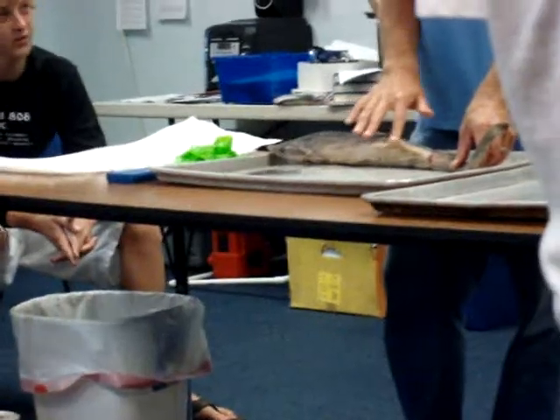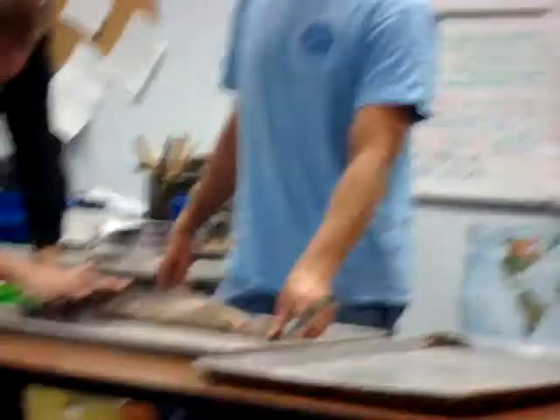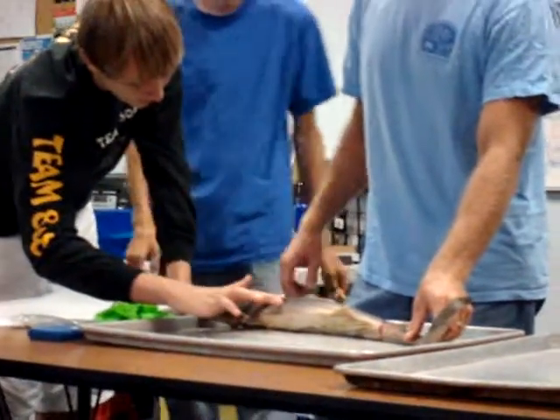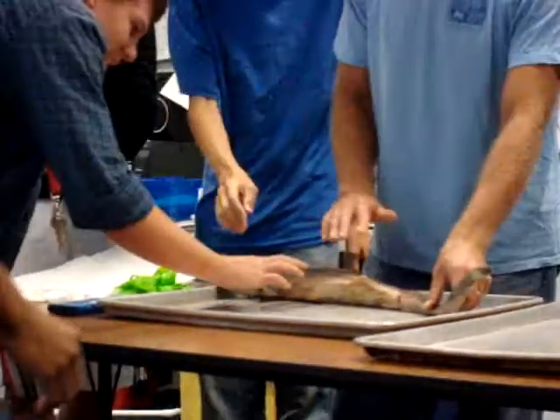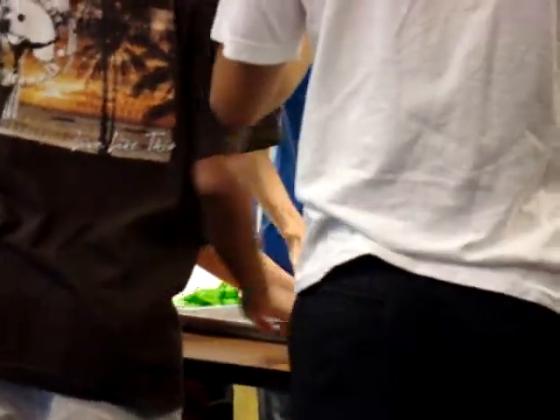Finger back the other way. Doesn't really work the other way. Got you back down. Come on up, everybody. Come on, guys. Everybody should go up and touch the shark. Just hold it. It's all nice and smooth, and it's like, ow. Yeah. And again, these dermal denticles are what allow them to be hydrodynamic in the water.